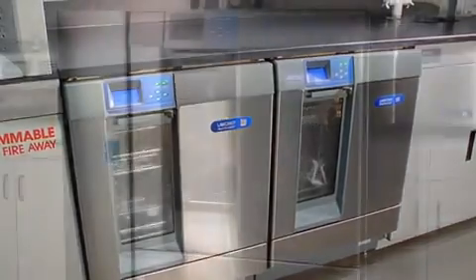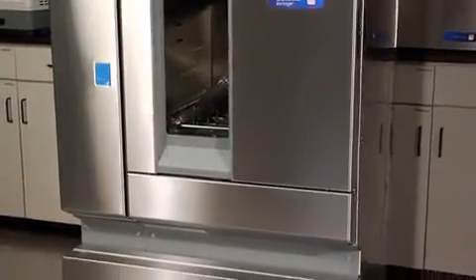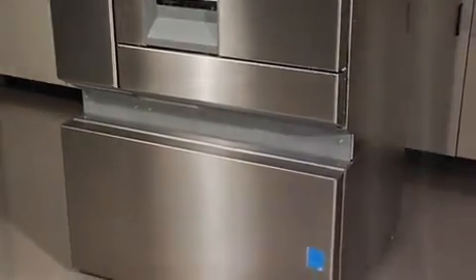LabConco offers three distinct automatic glassware washers, each designed specifically for laboratory use.